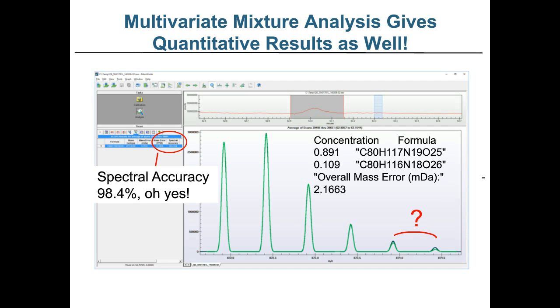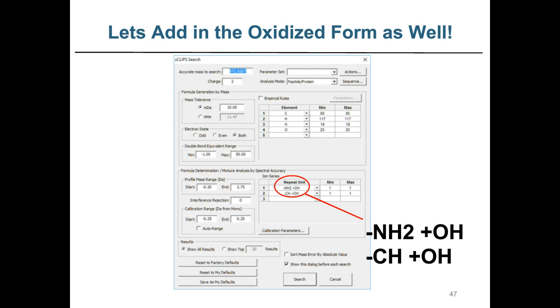So we thought we had a method. We thought we had a method working. Turns out that we don't. And this is a really good check to validate your results in this type of experiment. But interestingly enough, you'll see here at A+4 and A+5, it doesn't quite match. There's some error there. And what's the other potential degradation pathway? The other potential degradation pathway is oxidation.